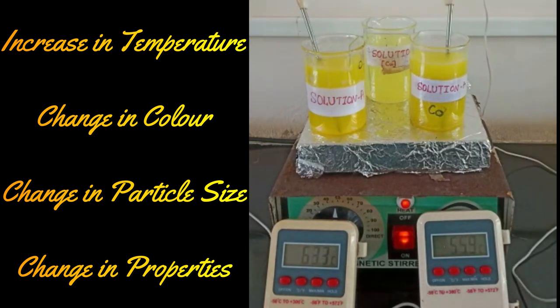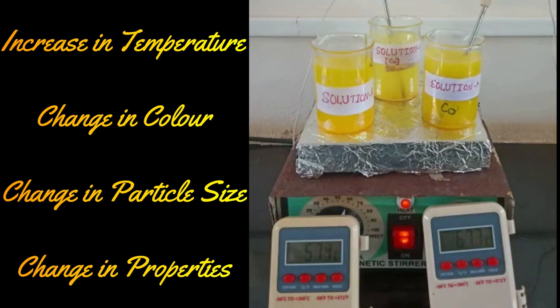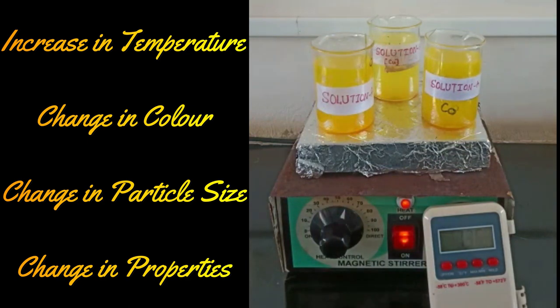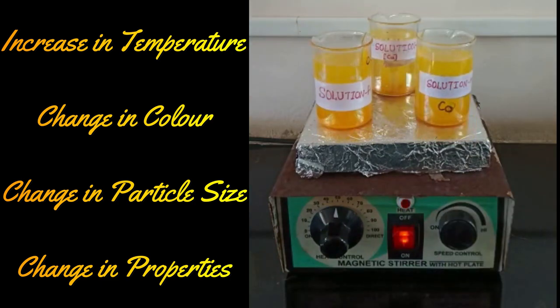When dopants are added, even the color change is a little bit varying. This color change is showing the change in the particle size, which means there is a change in properties. Especially we can observe the quantum confinement effect. This color change where the particle size is going to decrease implies that energy gap of this semiconductor, that is CdS, is also going to change.